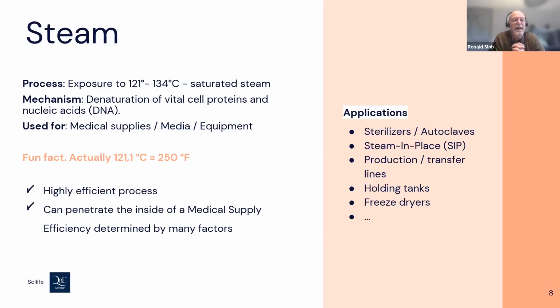So it's a highly efficient process. Yeah, you can also see in the annexes and in all the guidelines that it is the preferred method of sterilization. And the biggest advantage is that it can penetrate inside your medical supply or your vessel or some other things, which most of the other sterilization methods don't have the ability to do.